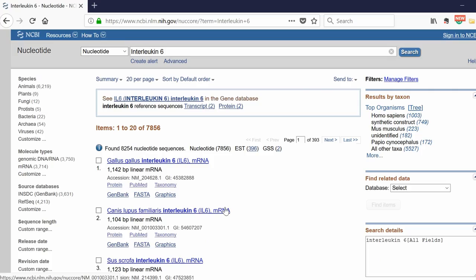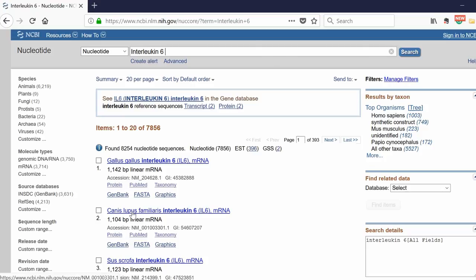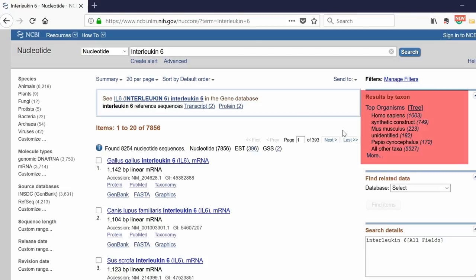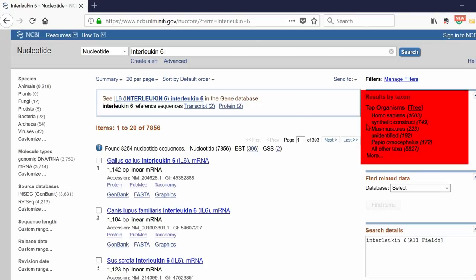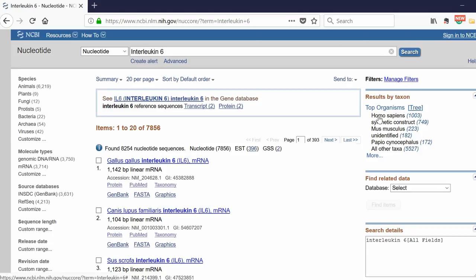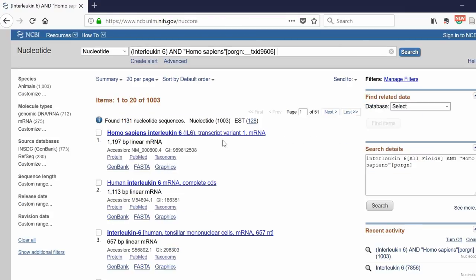This will return all of the information on this part of the website related to the gene interleukin-6. As you can see, there are different species. We're interested in humans, so a quick way you can filter this out is on the right, you can search by organisms. Click Homo sapiens, and by doing that, the top result says Homo sapiens interleukin-6 transcript variant 1 mRNA.